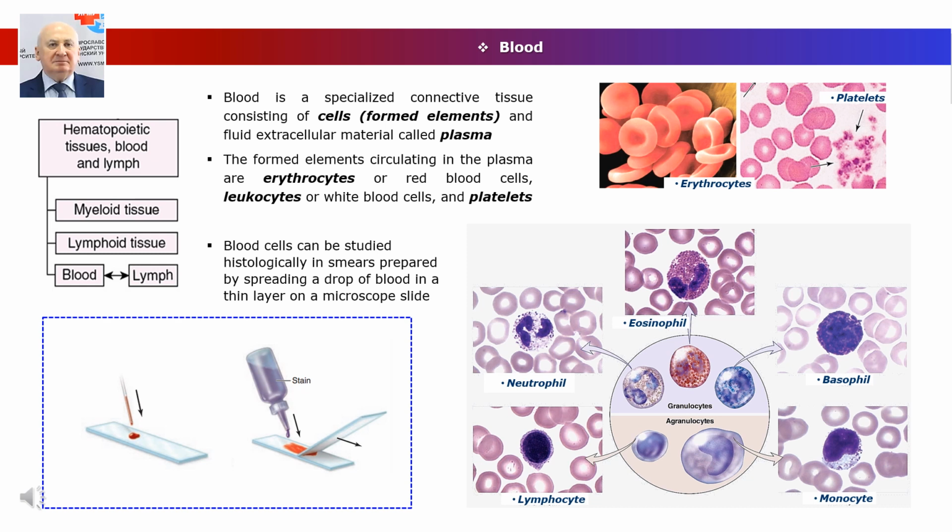Blood smears are routinely stained with mixtures of acidic eosin and basic methylene blue dyes. Some of these special stains, such as Romanowsky and Giemsa, are named after hematologists who introduced their own modifications into the original mixtures.